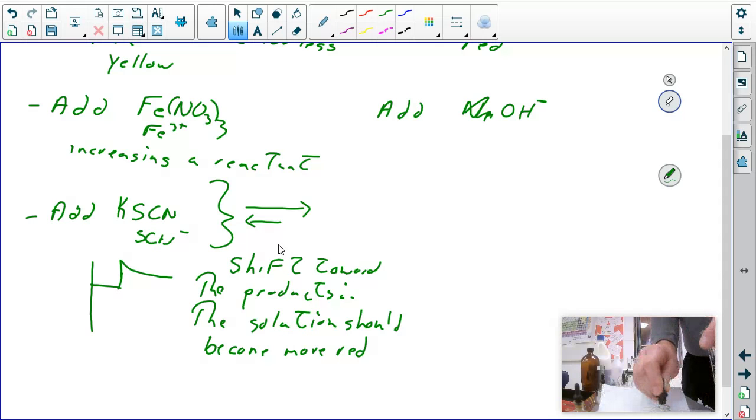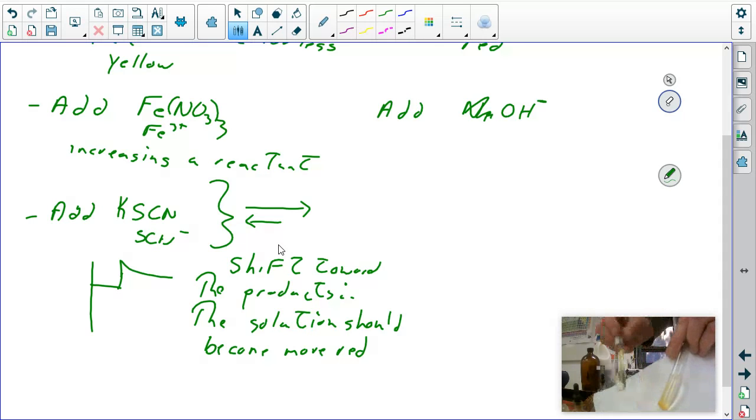And, okay, well, this is why we do experiments. I don't see the same color. Not sure why that one didn't work out to be the same. Okay. Now, experimental problems. I need to go back and see what's wrong with my experimental design.